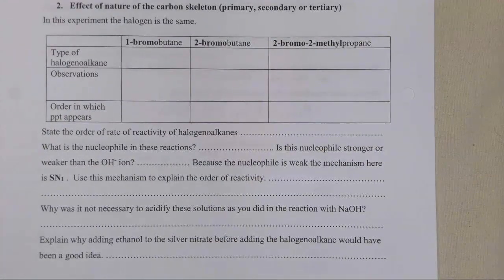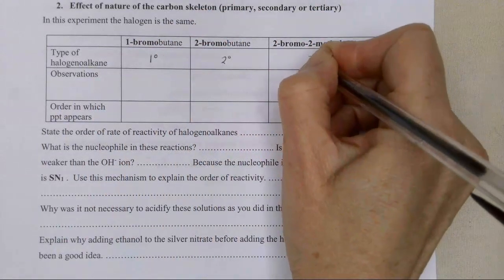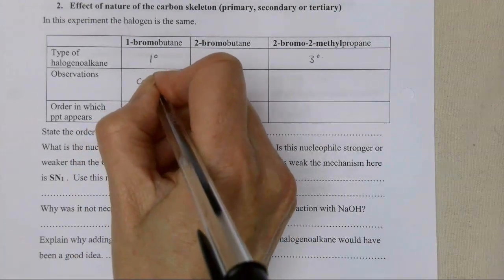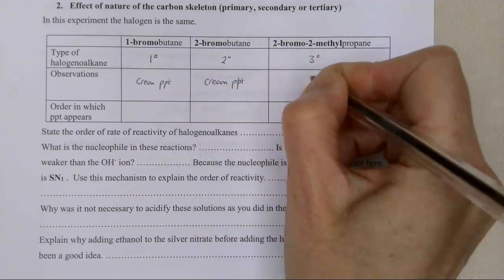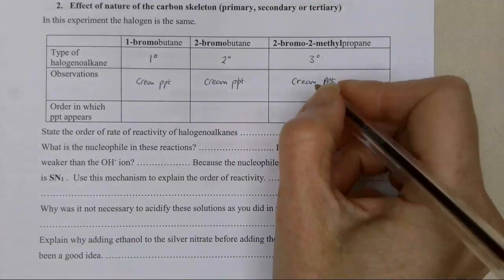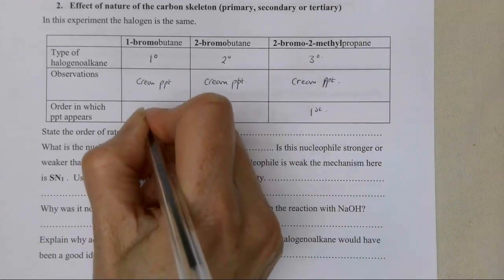Okay, looking at this second experiment, we're going to look at the effect of the nature of the carbon skeleton and what effect that has on the rate of hydrolysis. So we're going to use the same halogen this time, but we're just going to change whether it's a primary, secondary, or tertiary. So we have a primary, a secondary, and a tertiary. They all form this cream precipitate, because they're all going to form silver bromide. But in this case, it's the tertiary that reacts first, then the secondary, then the primary.